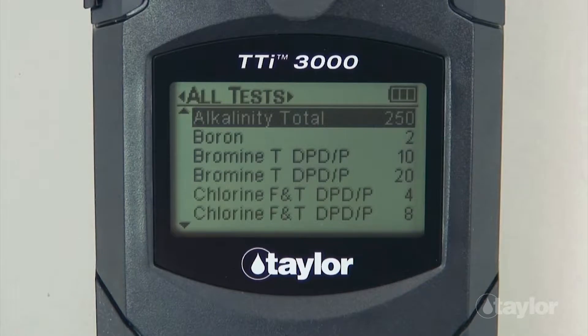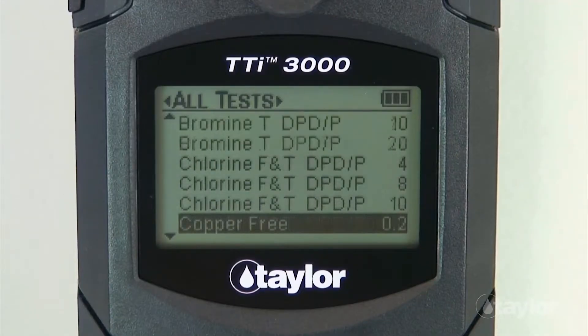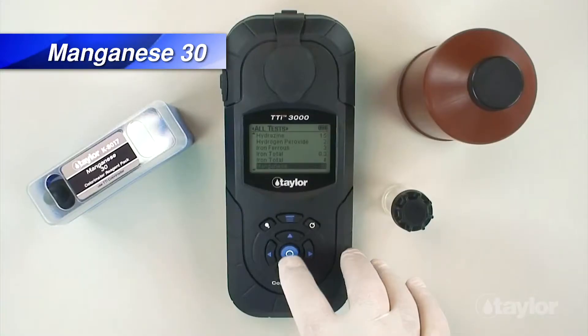If you have added the manganese 30 test to your favorites menu, it can be found there also, or in the recent tests menu if it's a test you have performed within your last 10 procedures. Scroll up or down to locate the manganese 30 test, then press enter.